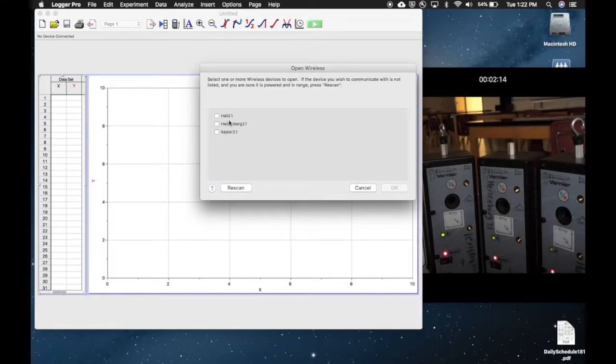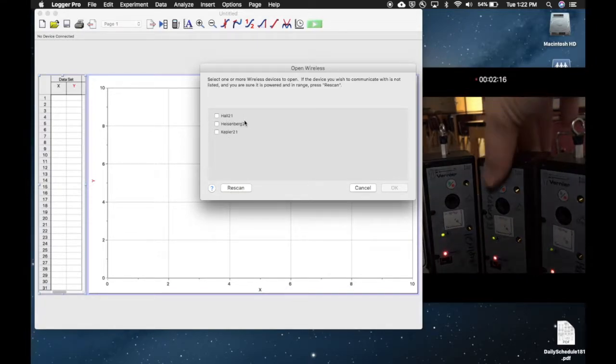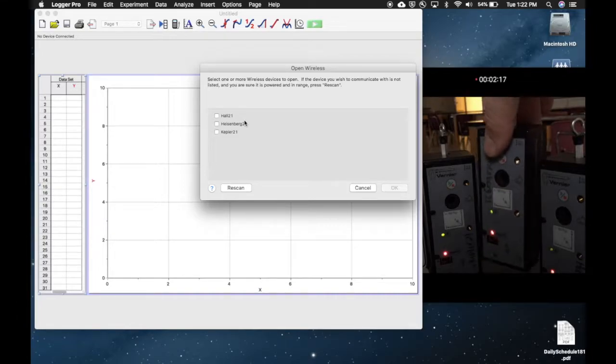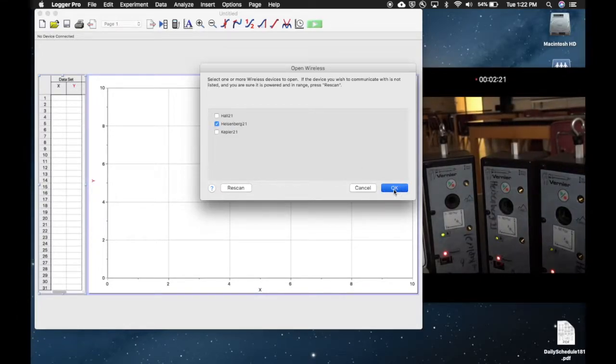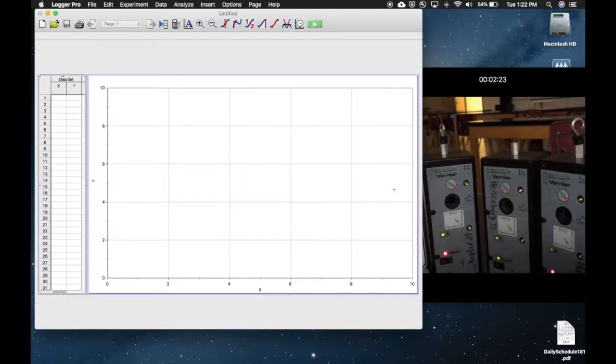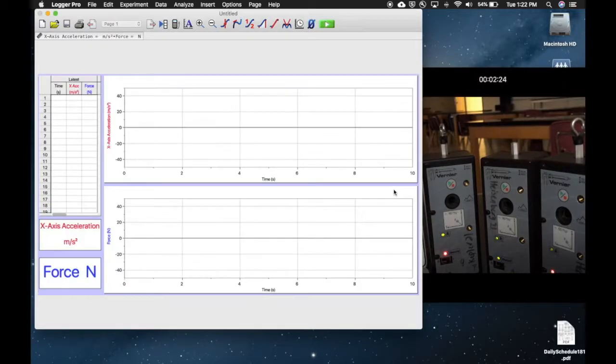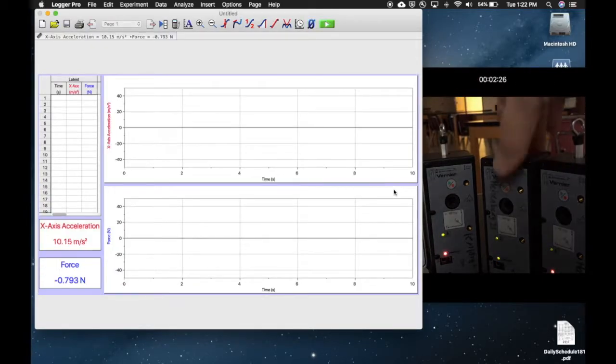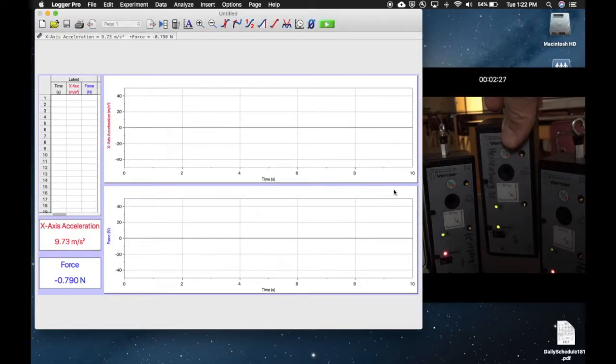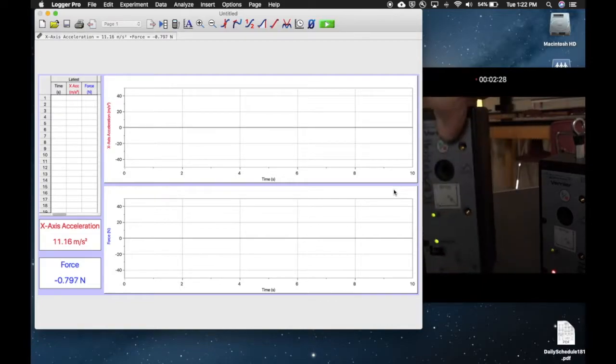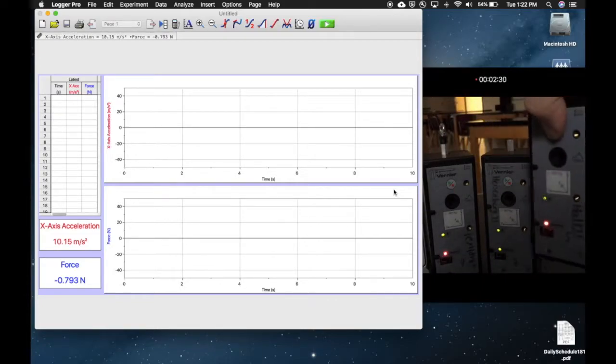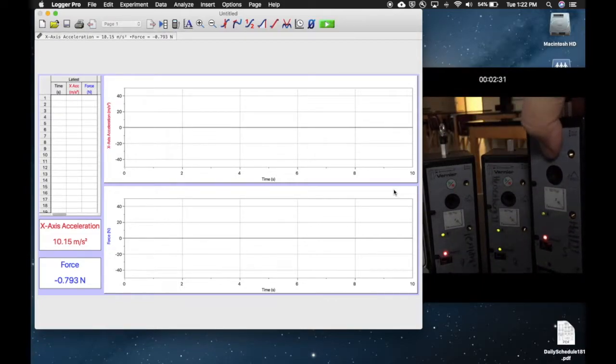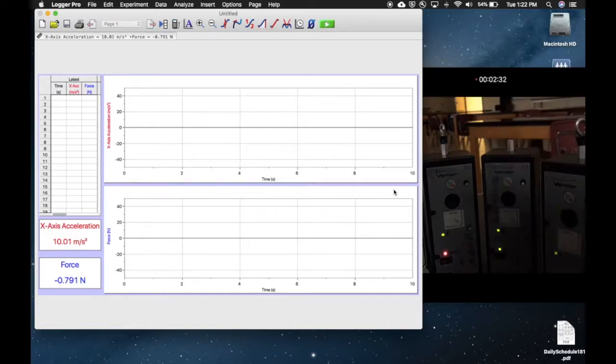What we would do is find the one that we want. Let's pretend that Heisenberg is actually the one we wanted to connect to. We would select that and hit OK. You'll now notice that Heisenberg went green because we are connected, and these two are still looking, so perhaps those are for people at other lab tables.